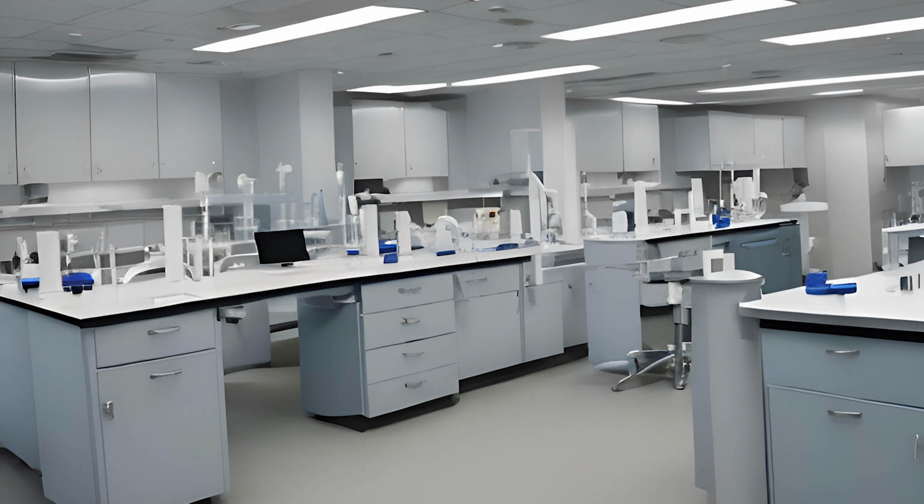Something to keep in mind is that safety goggles, glasses, and visors, including some that can fit over your regular eyeglasses, are available in many sizes and shapes. Personnel that wear contact lenses should be aware of the danger of wearing contact lenses in the laboratory. It is a bad idea to wear contact lenses in the laboratory, especially if you are working in microbiology. It is highly recommended to switch from contact lenses to regular glasses when you are working in the lab. And wearing contact lenses can make it difficult to flush your eyes properly.